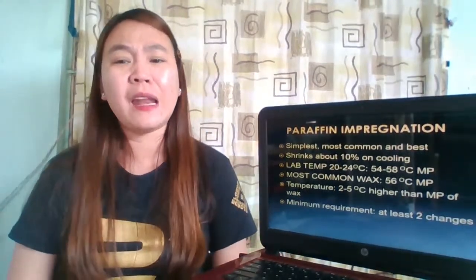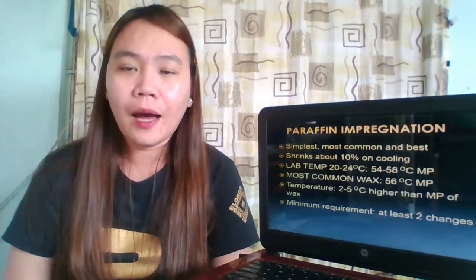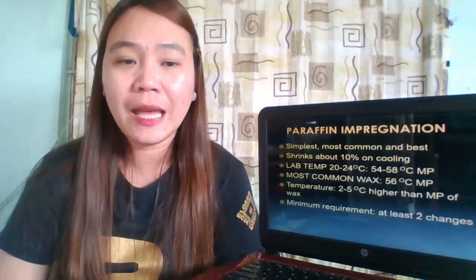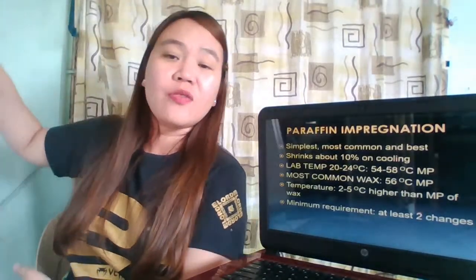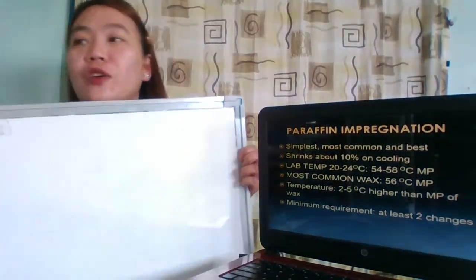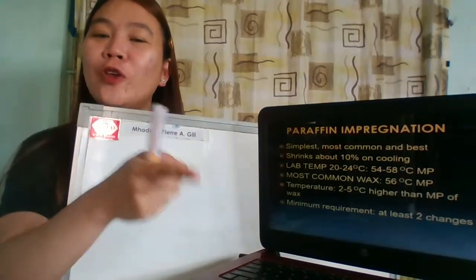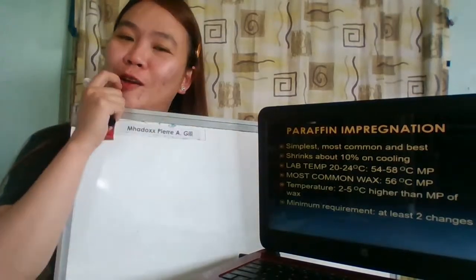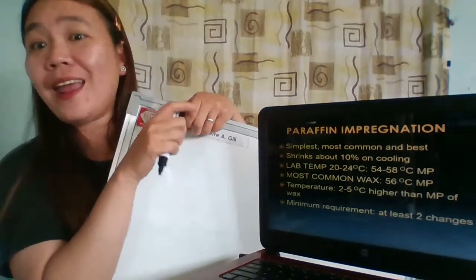Another temperature that we are considering during paraffin impregnation is 55 to 60. This is the advantage of online discussion because you can't see my saliva. It's raining saliva.